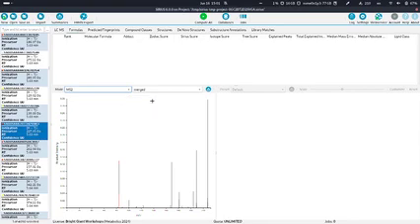What is important here is that by default we show a merged MS2 spectrum. And if you have, for example, measured the same compound with different collision energies, the merged spectra will look different than just the spectrum for the one collision energy, and you would be able to select multiple or the different collision energies of the spectrum here in this box.